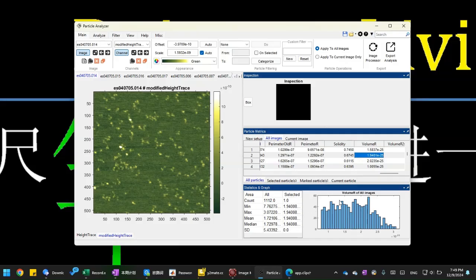So now what I'm going to do is place a filtering bar on this distribution. You can right click this graph and say place a data range bar. You can use lower bound or upper bound. Let's use the upper bound here.